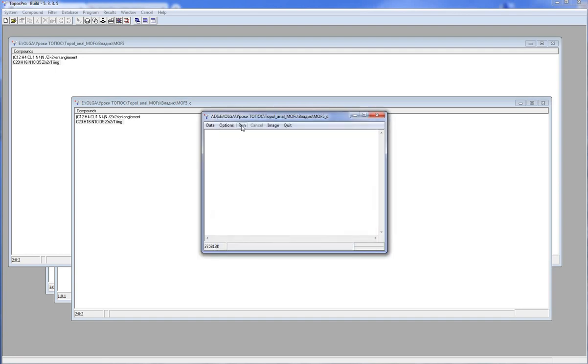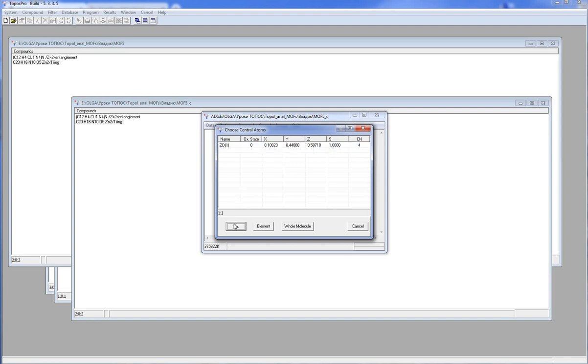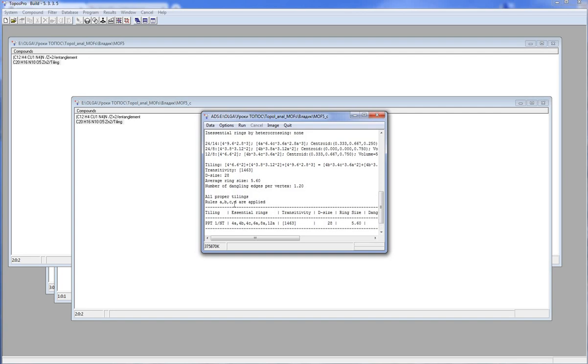I run ADS. It suggests to select central atoms. These are the atoms to be taken into account during the tile construction. I select all Z atoms. This is the information about all tiles and their properties. This table summarizes the main information about the tiling. You can find more information about tiling in our video lesson Constructions of Tiling.